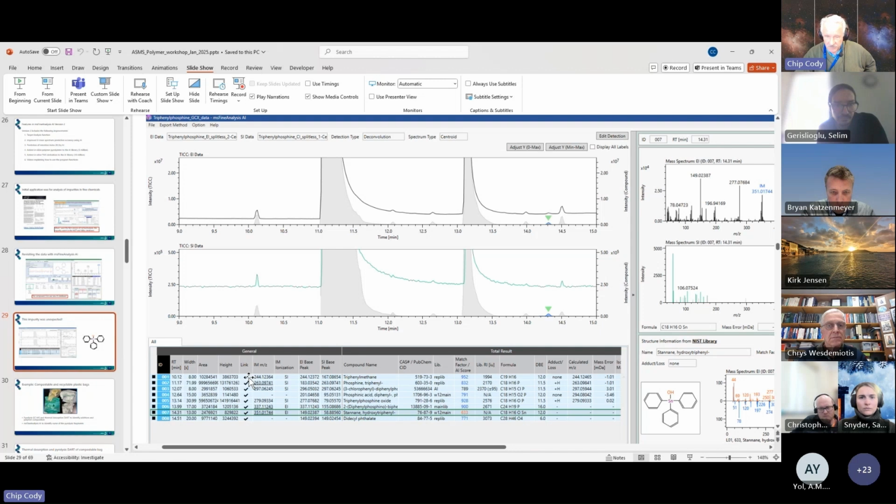We have fragment coverage, retention index matching. Can't think of what else, but for this, all of those things are consistent. For each of these, there are a number of hits from the database, but only those that are within the constraints are flagged and put in the table.